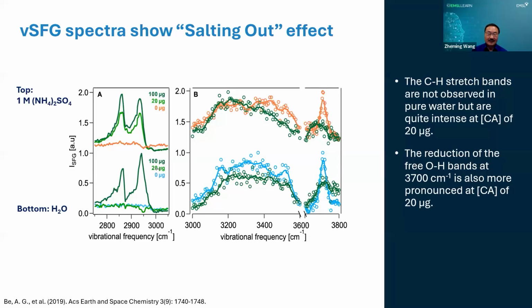salting out effect. Before adding the salt, there could be a fraction of the organics actually dissolving in the solution. However, once you have salt in the solution, it actually pushes out the organics that originally dissolved in the aqueous phase. That's exactly what we observed here.